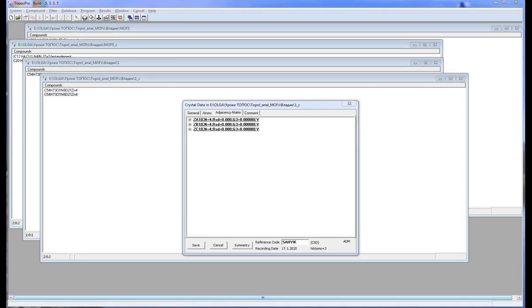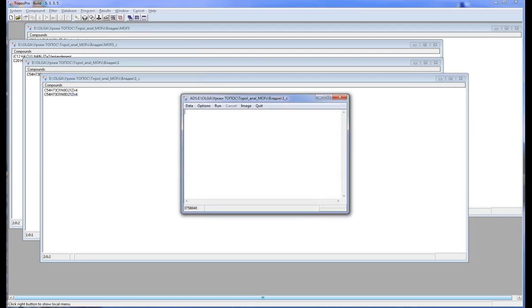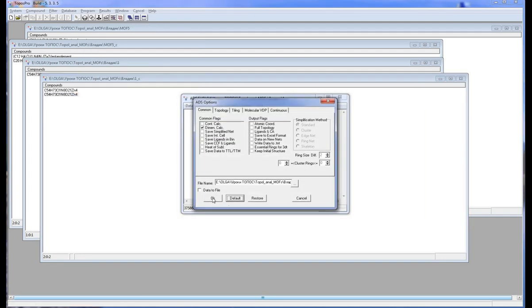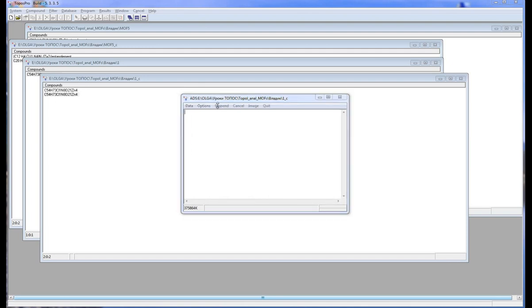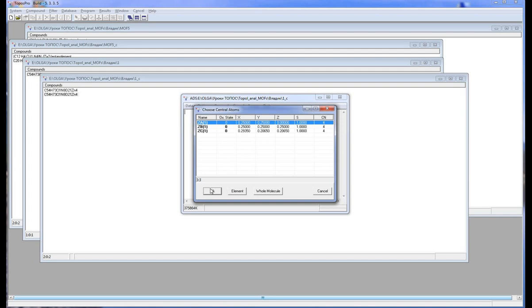For this purpose I use the ADS options default button. This button sets the options for classification of the underlying net of the crystal structure. I should select central atoms again. In this case central atoms are taken into account during classification. Other atoms are not considered. We should consider all nodes.